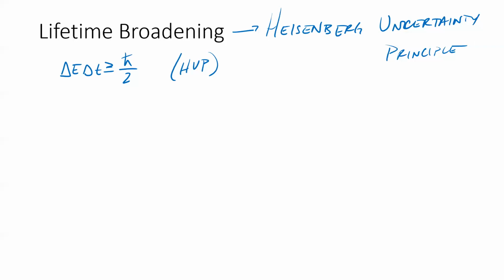Right? And it should be relatively straightforward for us to recognize why a short lifetime is a bad thing. If we absorb a photon and then immediately release a photon, if it's nearly instantaneous, then it's almost like that absorption never even happened, right? Because the detector doesn't see the fact that we're missing a photon. We absorb one and then we re-emit it immediately.